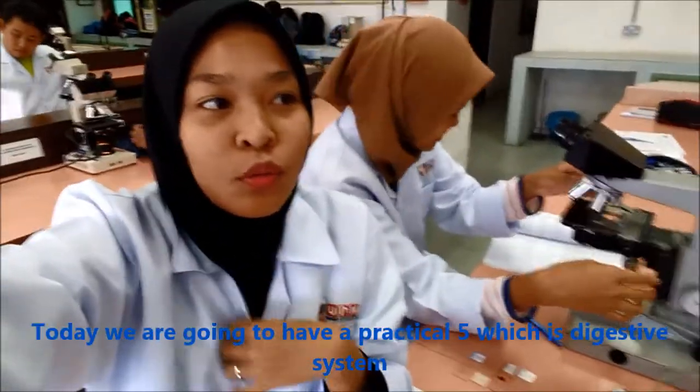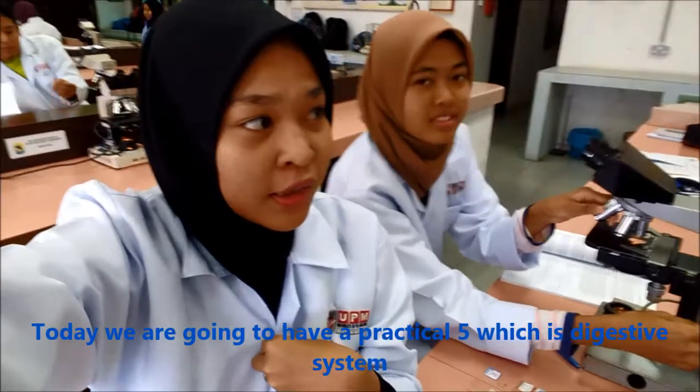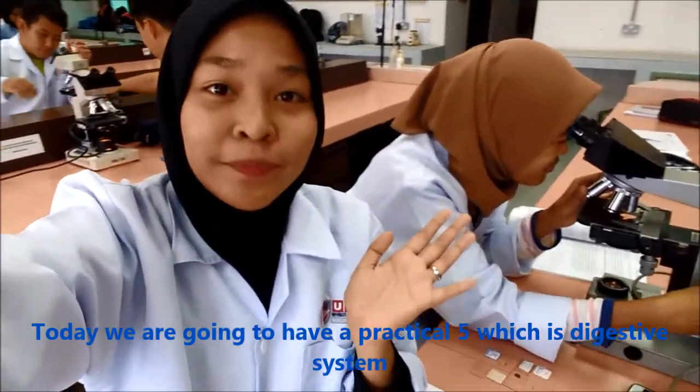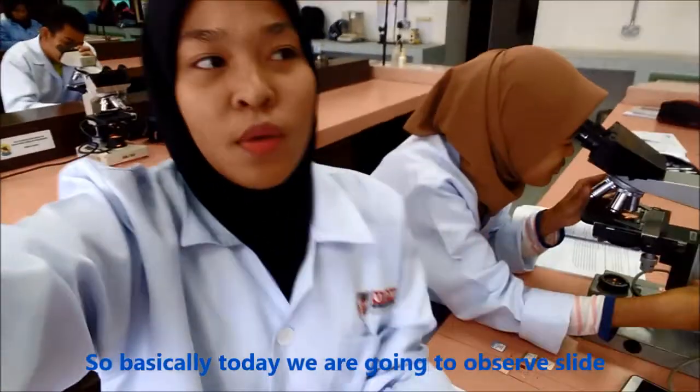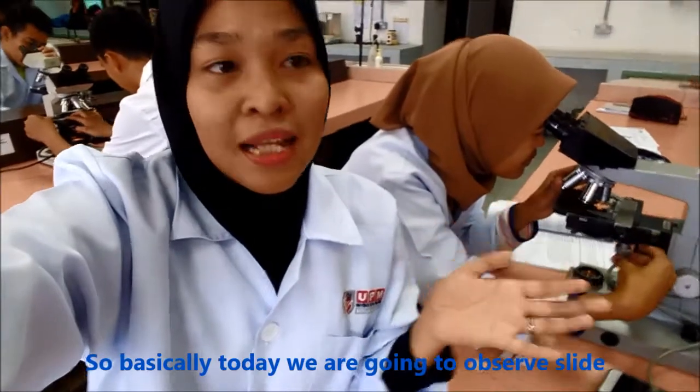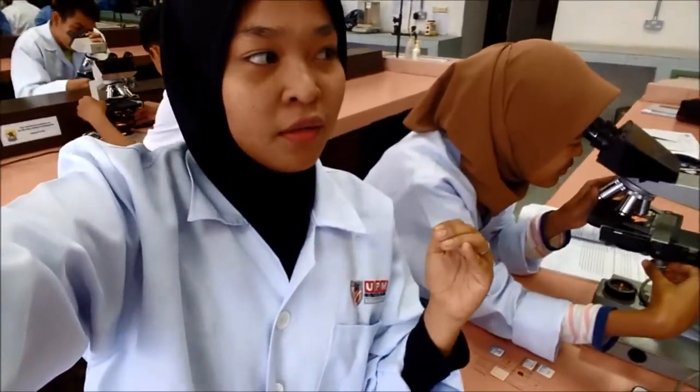Today we are going to have practical 5, which is the digestive system. Basically, today we are going to observe a slide. All the slides have 10 slides.